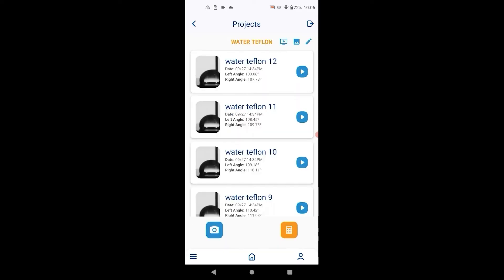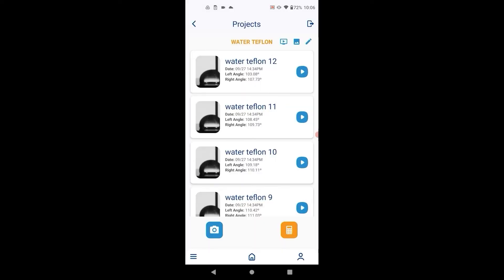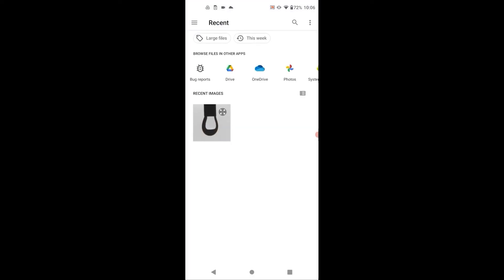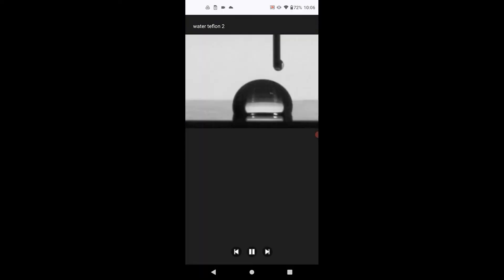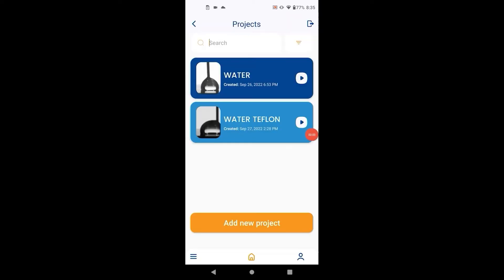A few features are accessed from the project screen. The project parameters can be edited. You can load external images into the project, and you can also run a video slideshow of the images in the project in chronological order.